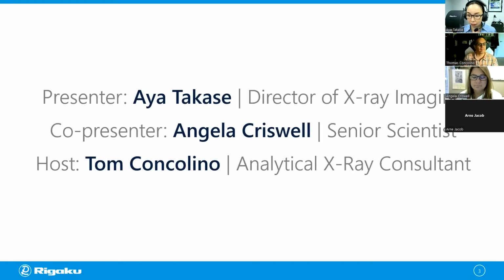So this is the first of 3 sessions in our deep dive series on digital rock analysis. This session will be taking place in the lab with Aya and Angela reviewing in real time how to develop a scan for rock and mineralogical samples. They'll also offer their thoughts on dealing with the unique challenges of performing CT experiments on these types of samples. So please note, if you missed any of the previous webinars, you can view them on the Rigaku website.